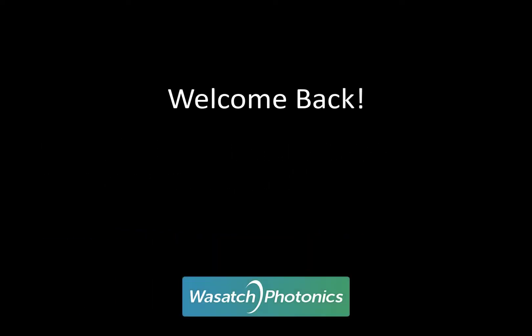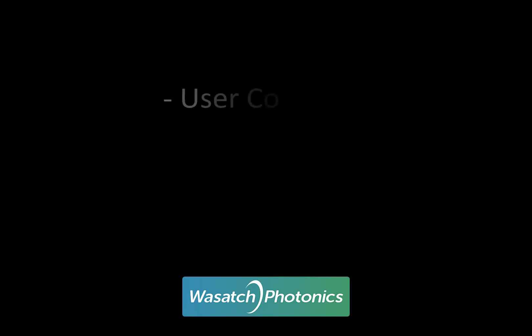Hi everyone and welcome back to the Wasatch Photonics YouTube channel. Today we are going to continue our Enlighten series with a video elaborating on a portion of the user controls introduced in our other video entitled, Navigating the Software.